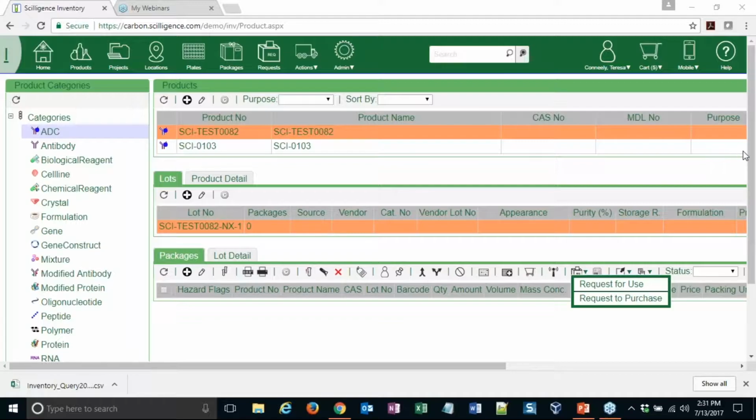How many users can your system scale to? We've never had an upper limit. So for one company, for our electronic notebook, we have 6,000 users. We go from 1 or 5 users to like 50 users to, on the upper level, 4,000, 5,000 users. Enterprise level.